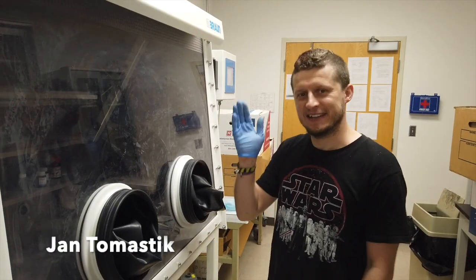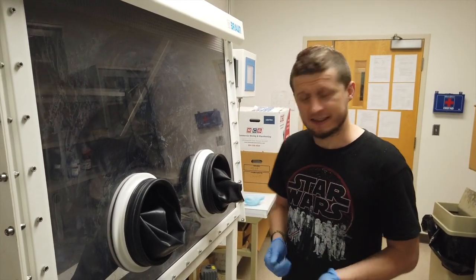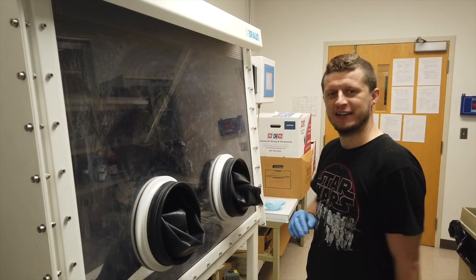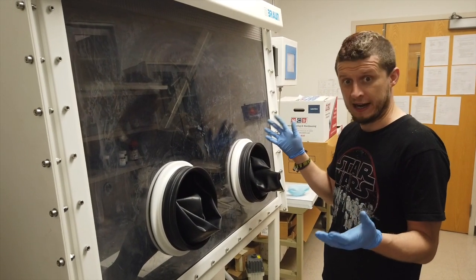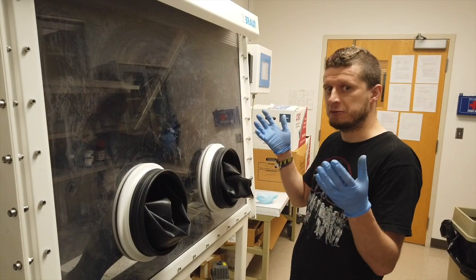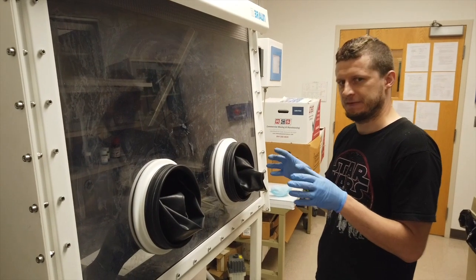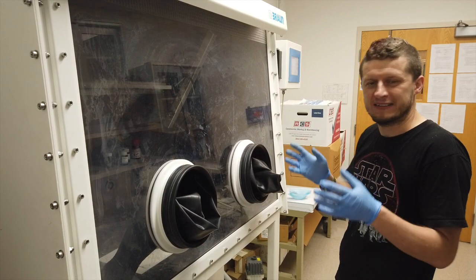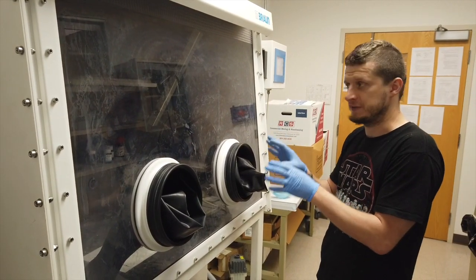Hello kids, my name is Jan and I'm doing this research at Virginia Tech. I come from the Czech Republic, and I'm here for some research day. What we have here is a different atmosphere, like you would be on a different planet. Why? In the air around us, we have nitrogen, oxygen, and some other gases, but some of the materials are very sensitive to oxygen. They could be broken and spoiled, and we need some type of materials that can survive in different atmospheres.